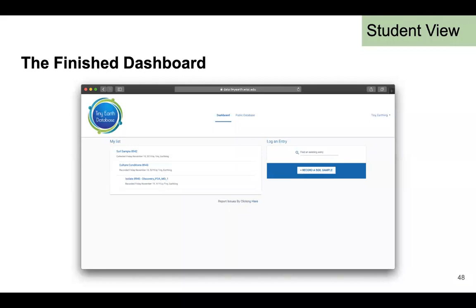But you also can do this, for example, if you have a small class size, at the stage where you're promoting isolates. We're working on a future version, I think Jen alluded to this, where if you've got a larger class or you've taught this so many semesters and have a lot more information, you'd be able to see all of your information.